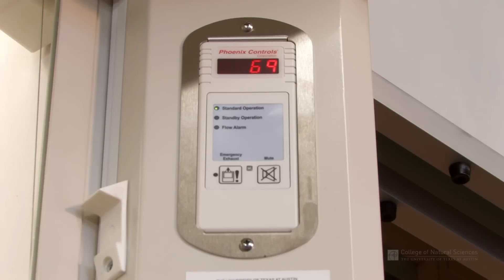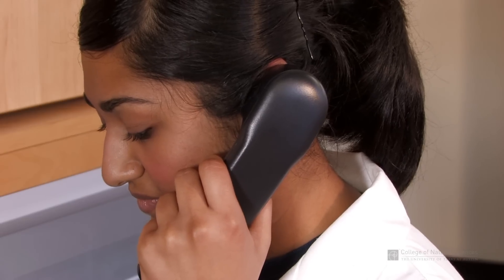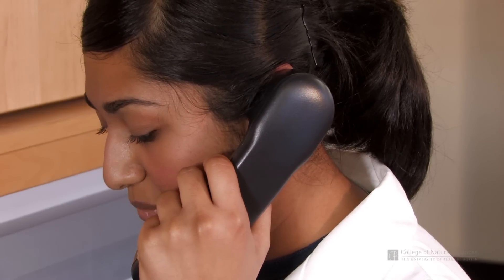Before starting work, you should check the fume hood monitor to ensure that the hood is functioning properly. You should never use a fume hood when it is in alarm mode, and you should never mute or disable the alarm. Instead, call EHS if the alarm is activated.